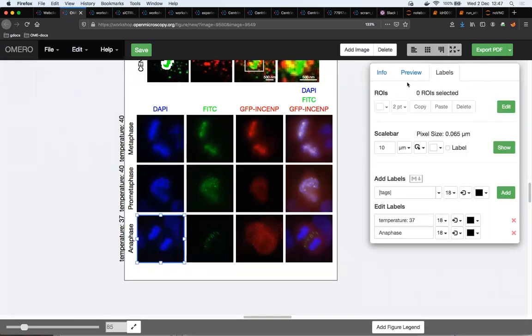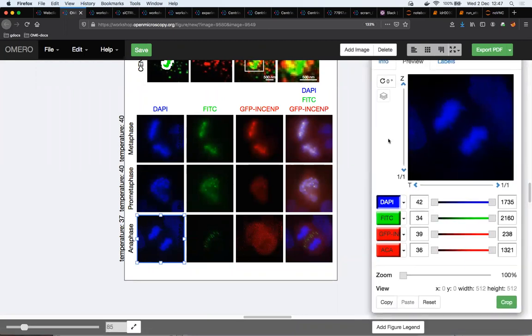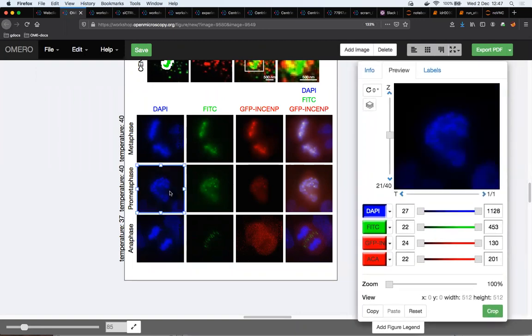Now I can go and adjust the Z section of this image if this is a multi-Z section image, such as this one. And I can go through the Z sections even here, or indeed I can make a projection. So basically, I think that you can start to understand that this is solving the horrific workflow which a scientist typically does from a software of interest, such as ZEN software, where you have to export the image, let's say, as JPEG from the original image.